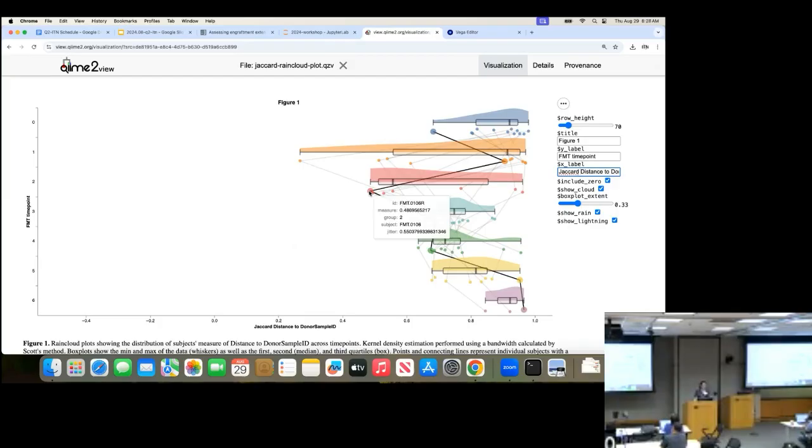So you're now able to facet this so that it includes both groups, which I think is cool and was created via feedback that we got from FMT researchers that said, we need this for this to be usable. So another example of me wanting to hear as much feedback as you guys have, because what you guys need is what we're trying to create, not software you guys can't use or isn't helpful.